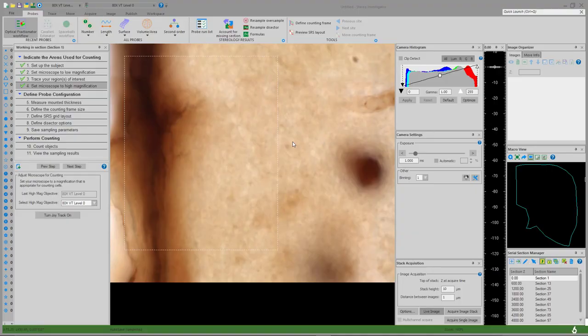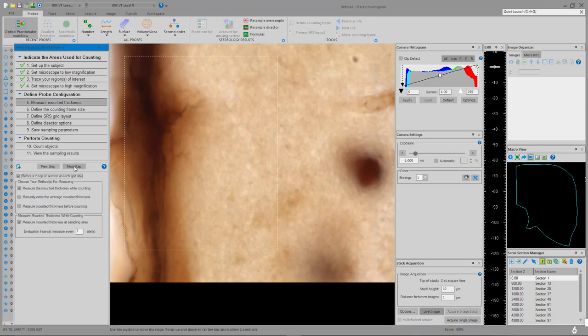Now we've gone up to our high magnification oil objective, so we're ready for step 5: measure mounted thickness. We want to select the default options almost all the time — measure the mounted thickness while counting, measure the mounted thickness at sampling sites, and select every one site. Then we'll go on to the next step to define the counting frame size.